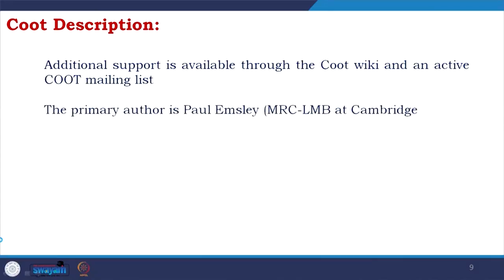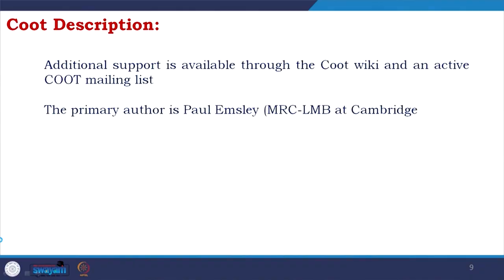They are very helpful. Any problem you have, you just mail them and you will get answers. Also, if you are part of the mailing list, you will see other users, new users like you, are facing problems, which will be good for you to learn things which you do not think or you do not face, but others are facing. So, it is good to be part of the Coot mailing list.